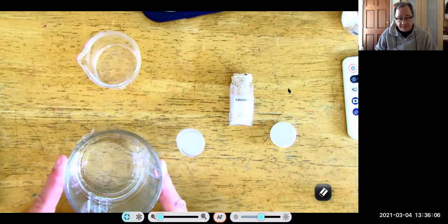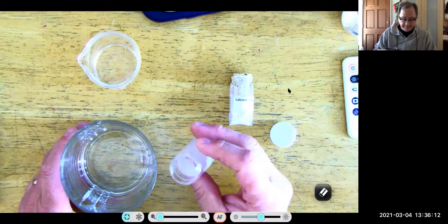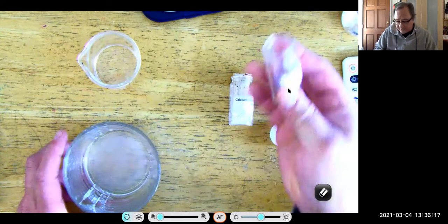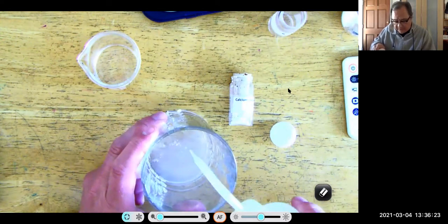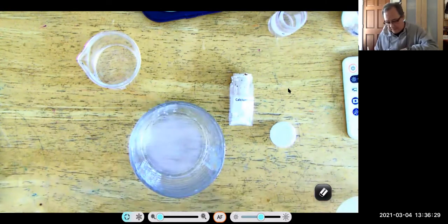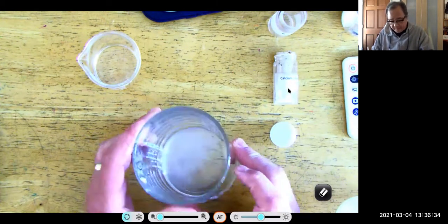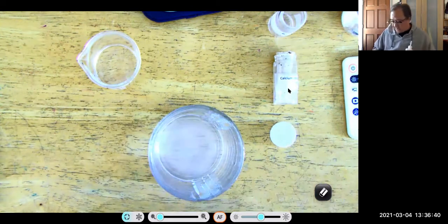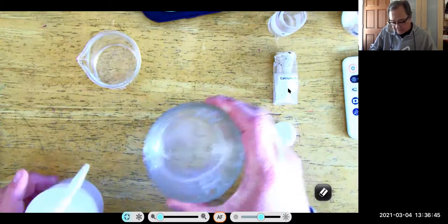See that a glass appeared out of nowhere because I set that down before I started the recording again. And I'm going to take my calcium chloride and pour that into this glass here. And you can see at the bottom of the glass that it's a little cloudy, and so not all of the calcium chloride has dissolved. So I'm adding more water to help it to dissolve completely. And my water bottle leaks a little bit, so that's why you keep seeing me rub the tabletop, just to get rid of the water droplets.